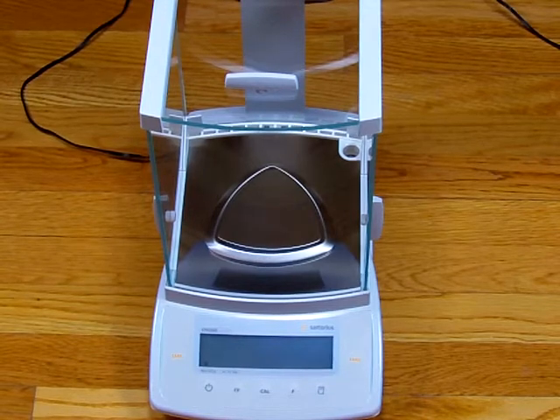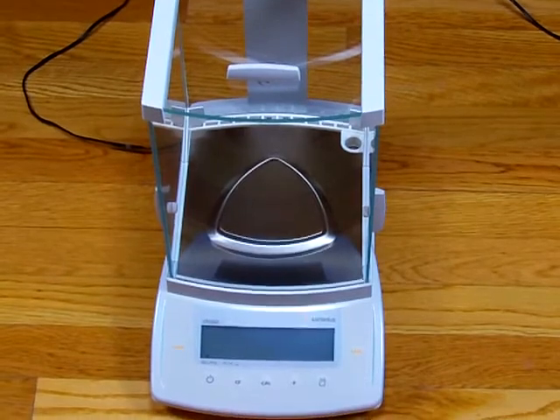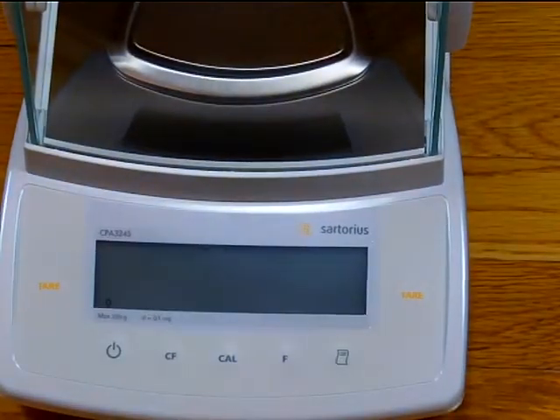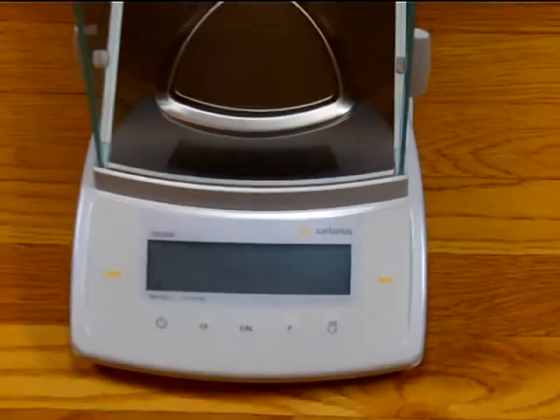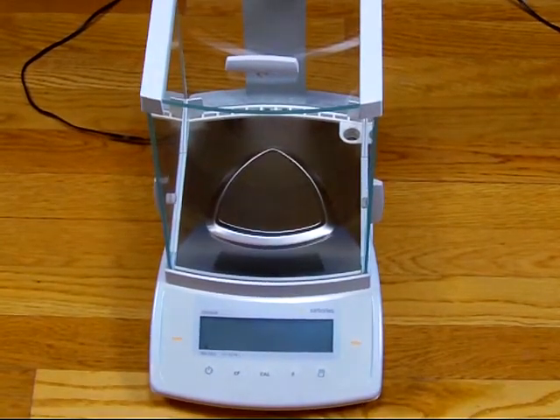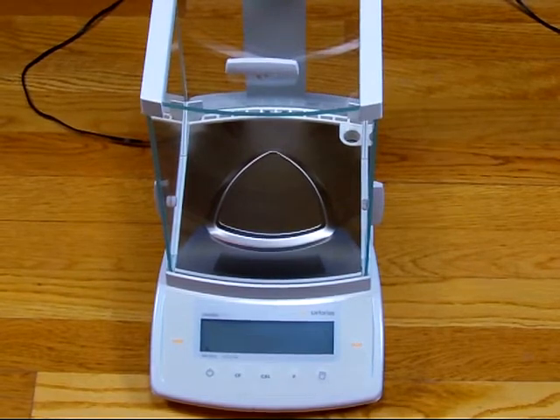Precision Weighing Balances would like to introduce the Sartorius CPA324S Analytical Balance. This balance offers a 320-gram weighing capacity with 0.0001 gram readability, making it a four decimal place analytical balance.